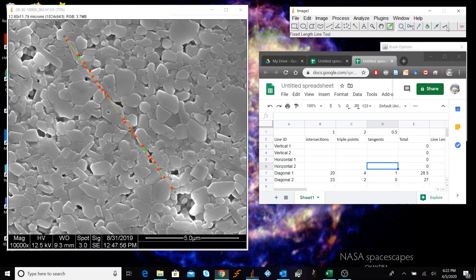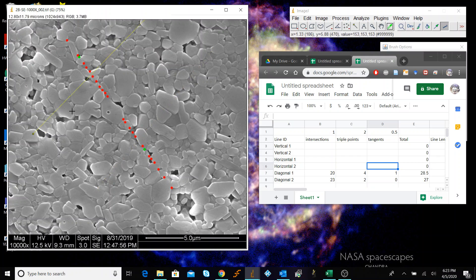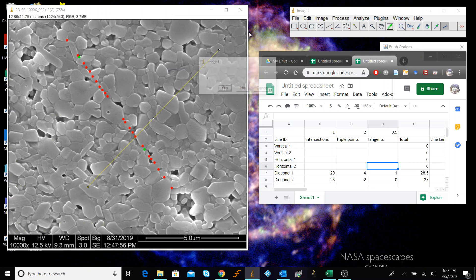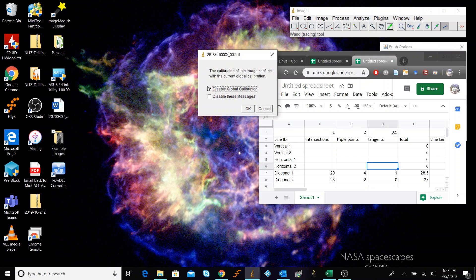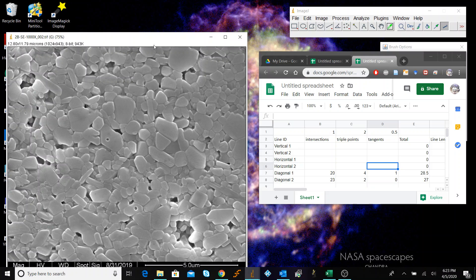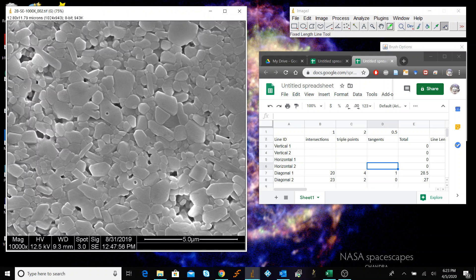Now we can draw another line and do the same analysis. We want several lines for decent statistics. Since the marked points don't go away, the easiest approach is to close the image without saving and bring it back in — we don't want to disable the global calibration, we want to keep that. When we reopen the image, we can draw a new 10-micron line and repeat.